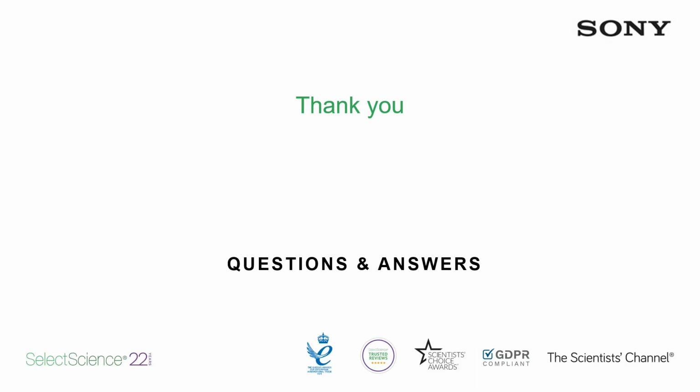Excellent, thank you. So moving on to our next question, we have, can bleach go through the nozzle since it's all in one piece? Yes, absolutely. Just as I mentioned earlier, you can run bleach through the nozzle. It's sort of our recommended cleaning method, and it's also what we're going to recommend to you for your daily shutdown. So when you go to shut the instrument down at the end of the day, we're going to say run bleach and run water through that sample line and through the nozzle.